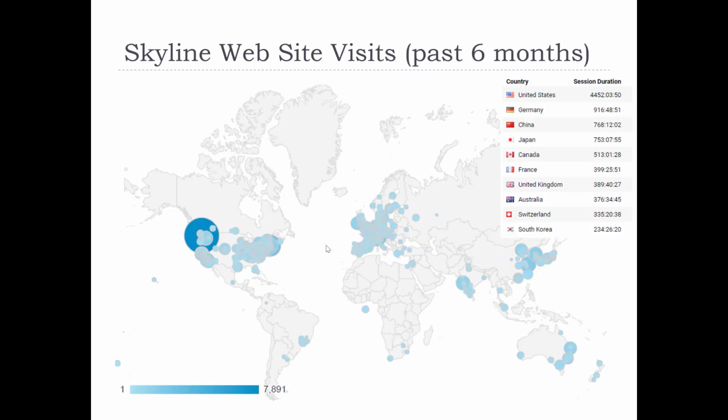And Skyline is also worldwide, so I think some of you are not from around Boston. It's allowed me to travel all over the world. Certainly the U.S. and Europe were very early adopters, and it's spread to places like Brazil, India, the Far East, and Australia, and even South Africa, where I'm going in December.